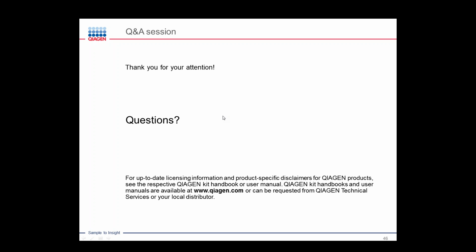So apologies for that. The last question is, will you please explain the RNA degradation and how it can be recognized at the 28S or 18S level, because this is still confusing for this person.